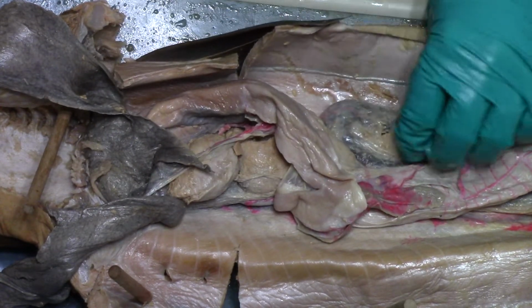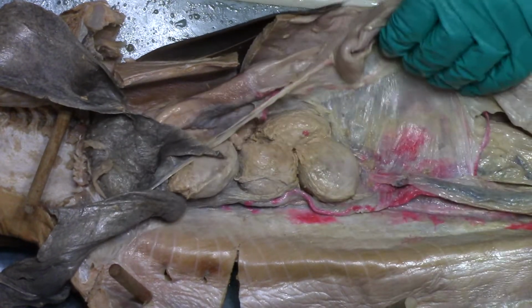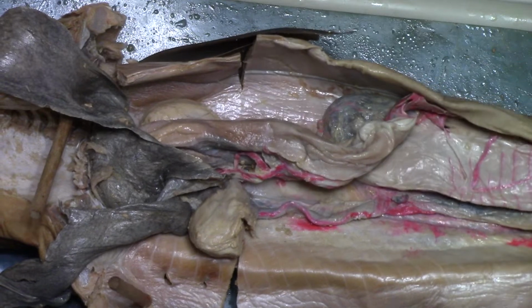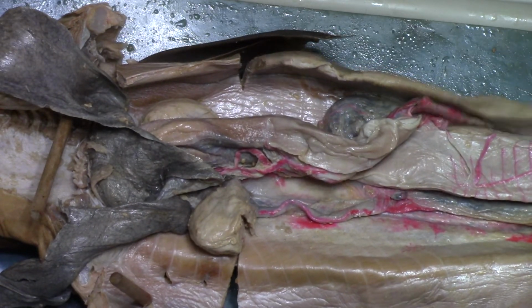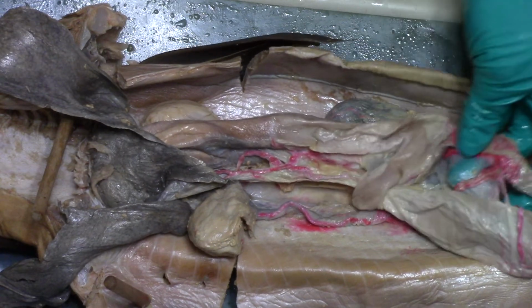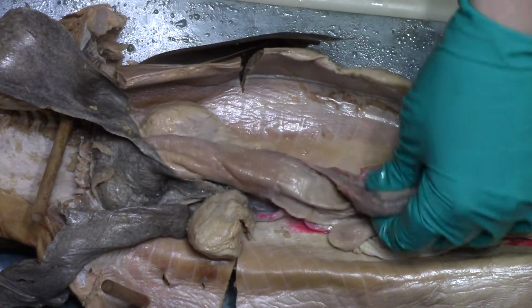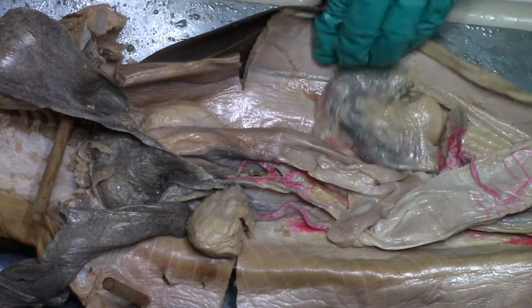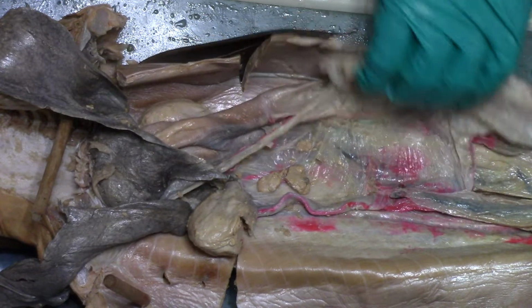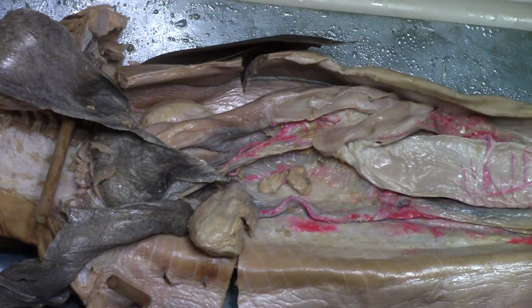And I'm not seeing it, this looks like egg systems, not the spleen. But I'm not quite sure where the spleen is. So I'll have to do a little bit more digging. It might be down here, because the pancreas and the spleen are usually attached, and I'm not seeing that. But if this is a pregnant female, there might not be a ton of room. Sometimes females will have smaller organs to make room for all of their eggs. I need to cut this a little bit better so I can flip this open too.